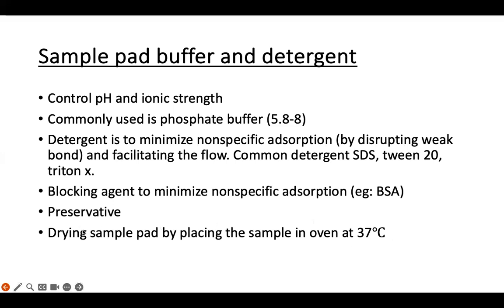Okay, as I mentioned, the lateral flow is very sensitive towards moisture. Okay, so drying and maintaining the dry condition is very important.